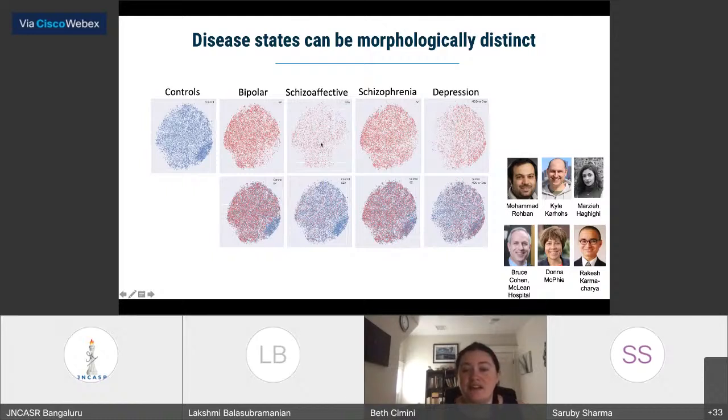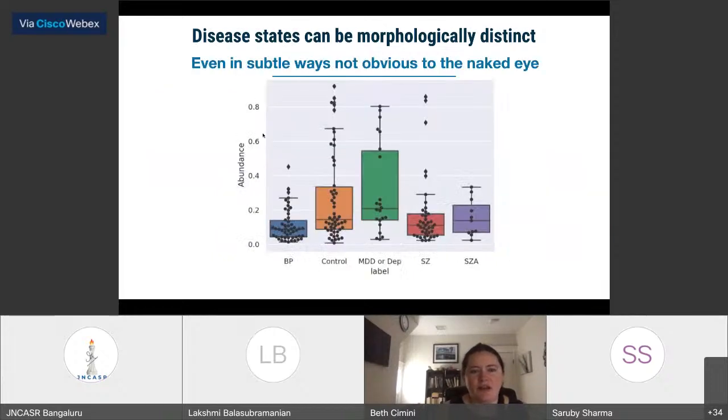there are some differences that we can tell even just looking at their skin cells, which of course gives you tons of ideas about what you might do in terms of either screening tools for diagnosis or screening tools to figure out which drugs might actually help these people by looking for particular phenotypes that are or aren't there just from a very simple skin punch. And again, just to sort of drive home this, this is something we only really could have discovered with these sorts of morphological profiling approaches.